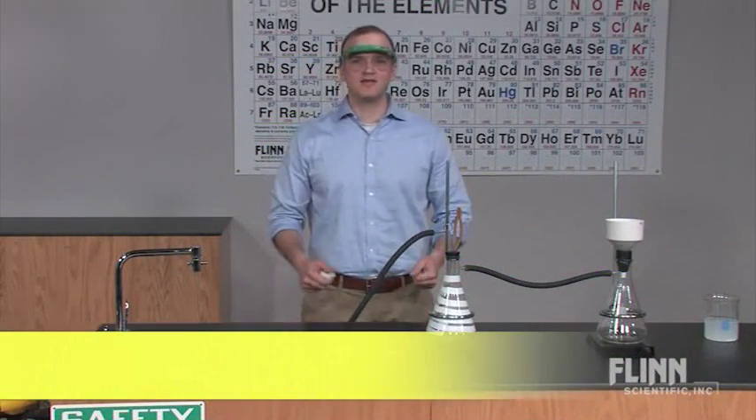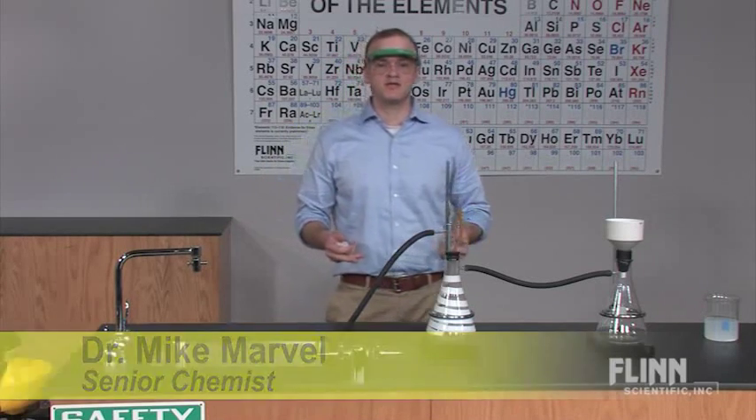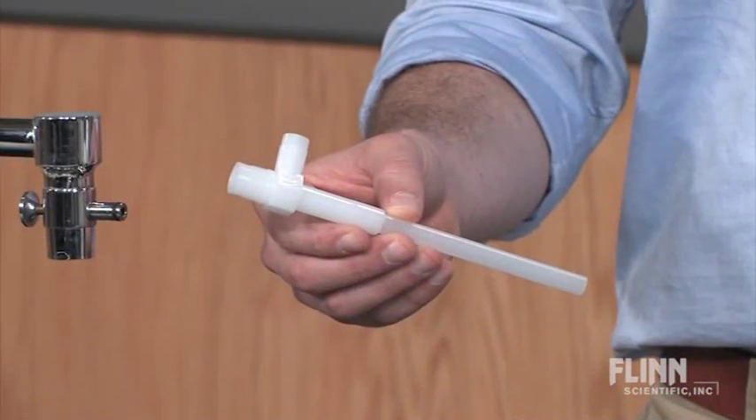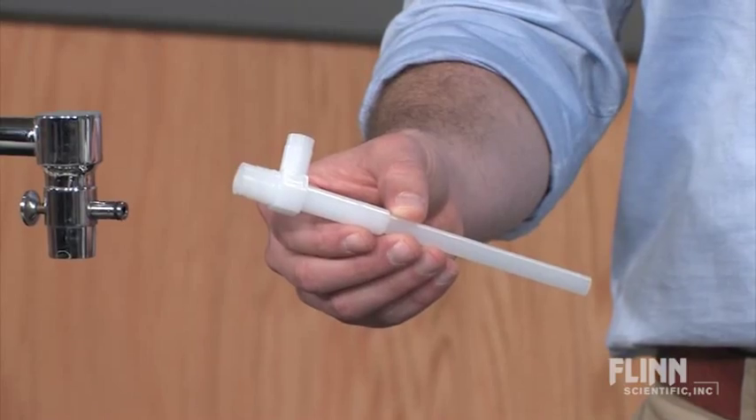Suction filtration can be a slow process, particularly if your school doesn't have vacuum pumps. You can speed up the process with a water aspirator from Flinn Scientific — an inexpensive and dependable source of moderate vacuum in your laboratory.